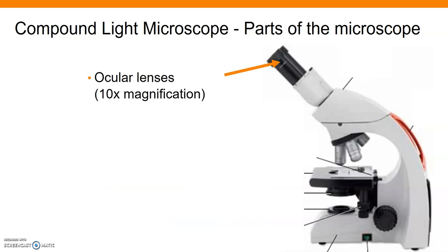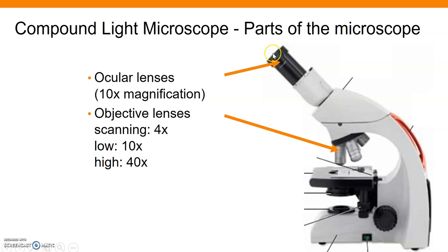Now let's talk about lenses. The light passes through from the lamp up through the slide here. Then it's going to actually have to come up, follow the path of light up to these oculars. The oculars are what we look through, and our microscopes are binoculars. There are two of them, so your eyes are going to be able to look with both eyes, which helps with eye strain quite a bit. I know sometimes students have a hard time getting used to using a microscope with two eyes to make sure it's matching up with your eyes perfectly. You can move these. If you grab hold of the oculars, you can actually move it, much like binoculars, you can adjust it to your eyes. I would suggest you take a few minutes to do that so you can see things really clearly through the microscope.